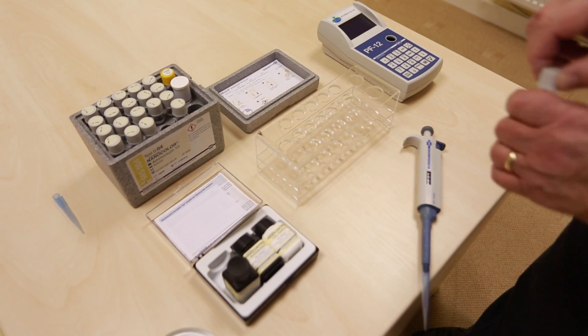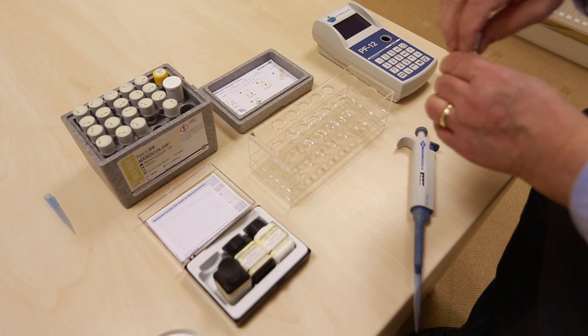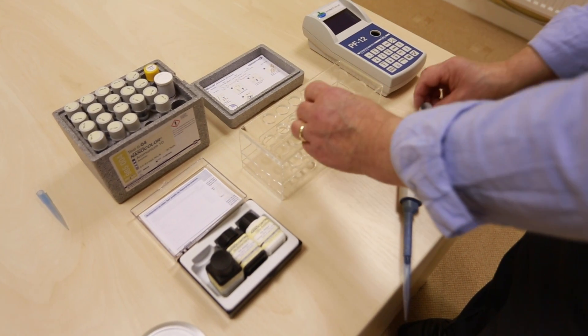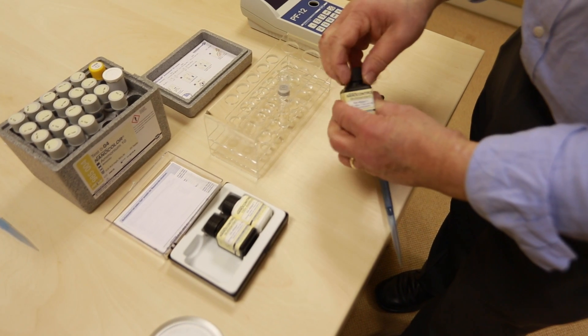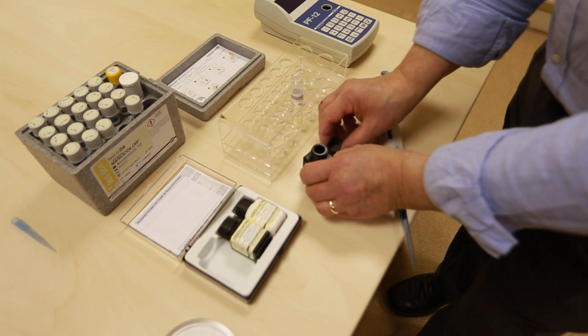Running an ammonia test. This is the ammonium 10 range. Open the tube. We're going to use a quality control standard in place of the sample.